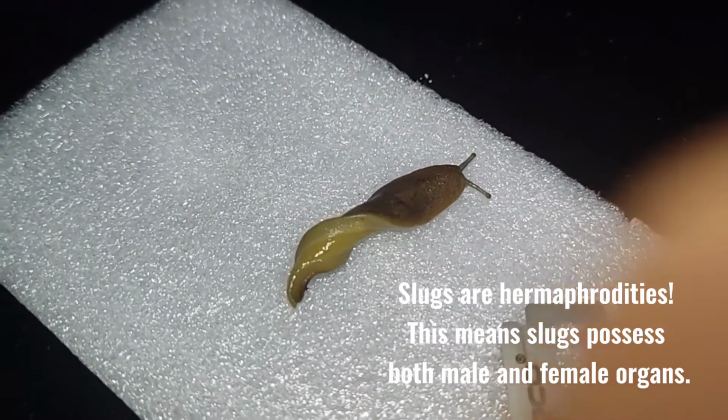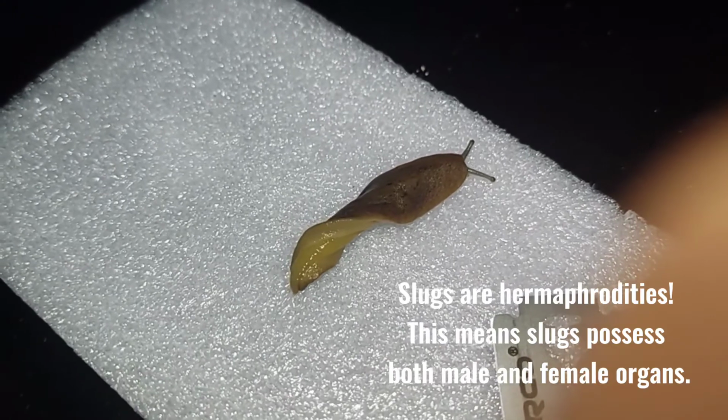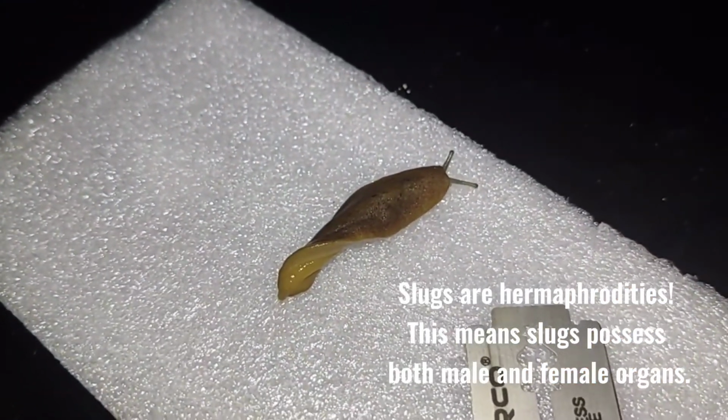Slugs are hermaphrodites. This means slugs possess both male and female organs.